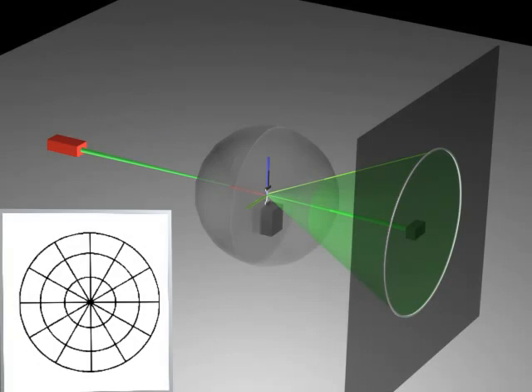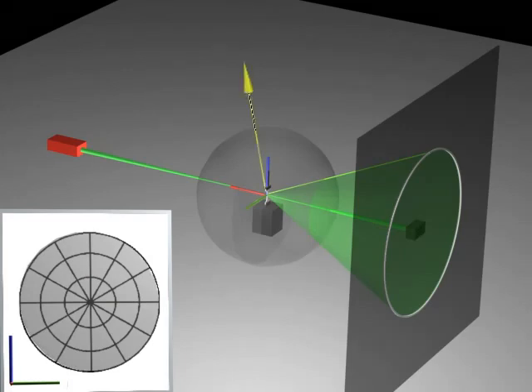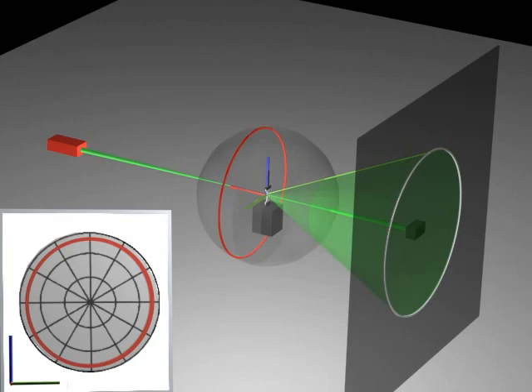In this schematic, the hemisphere of interest has the beam direction at its center. In terms of pole figure coverage, we shall be able to measure a continuous strip of scattering vectors simultaneously. With the beam normal to the specimen surface, the specimen loading and transverse directions are at points at the top and side of the pole figure. The intersection of the cone of scattering vectors with the highlighted Debye-Scherrer cone is a circle on the pole figure.